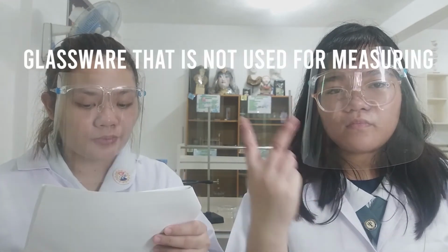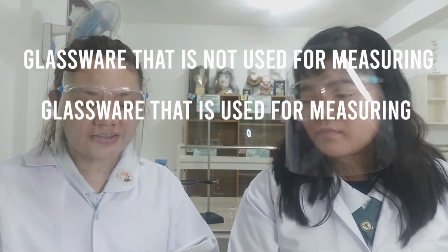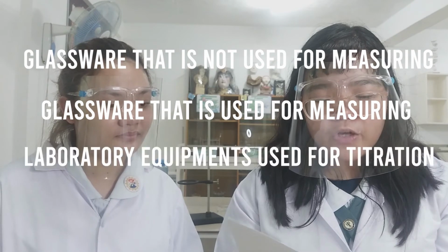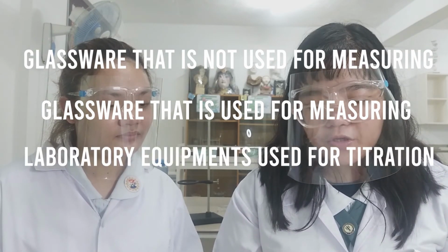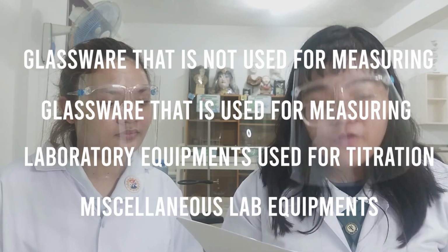To summarize, there are 4 categories in this lab equipment haul. The first 2 categories are the glassware that is not used for measuring and glassware that is used for measurements. And the last 2 categories are the lab equipment used for titrations, and lastly, the miscellaneous lab equipment that is used for various reasons. Remember, always follow the safety rules and guidelines when handling your laboratory equipment, for this can really save our lives.